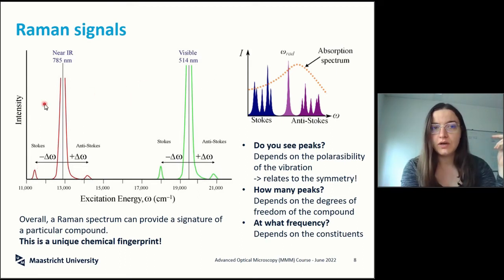Now these two possible lasers are very common because it's easy to have the green laser and the red laser. But if your molecule is active with both of them, you might want to measure it with both lasers. And in theory, regardless of what you input, you should still get the same trace of what is the shift. So this deviation will always be the same.